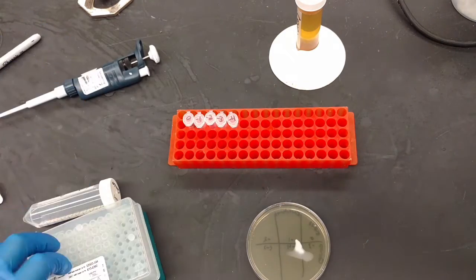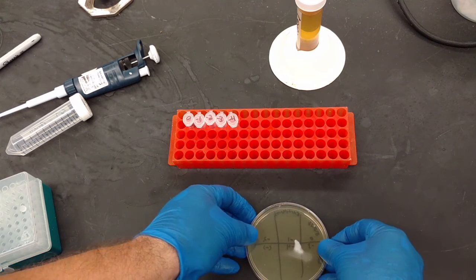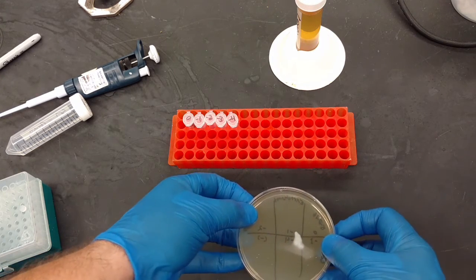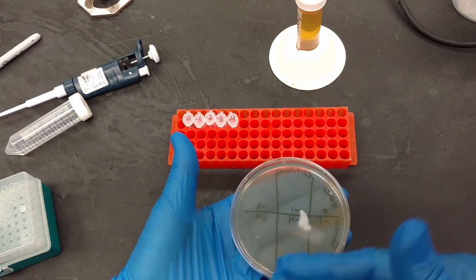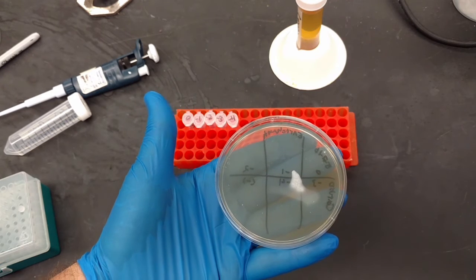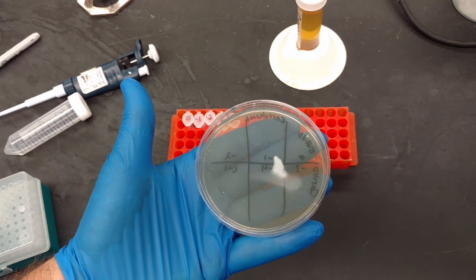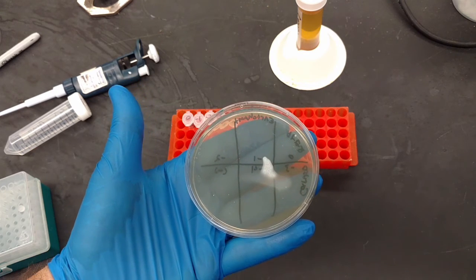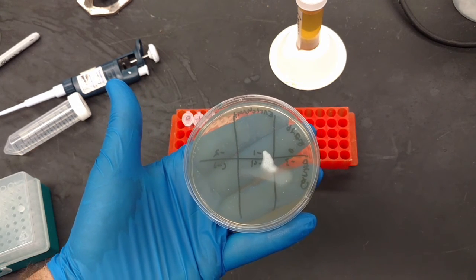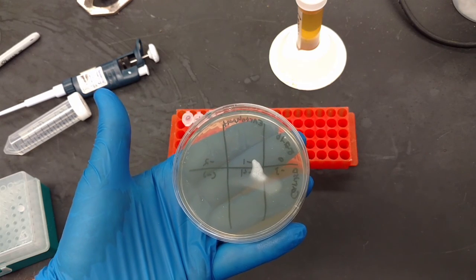The lab manual says to let the droplets sit for 20 to 30 minutes to soak in, but they never actually soak in. So carry the plate very carefully face up — don't flip it upside down or tilt it, or those droplets will run. Place it in the incubator face up. If you come back many hours later you can flip it over, otherwise just look at it tomorrow. Good luck!